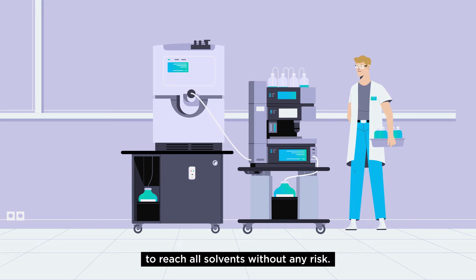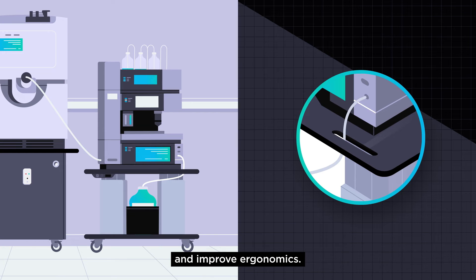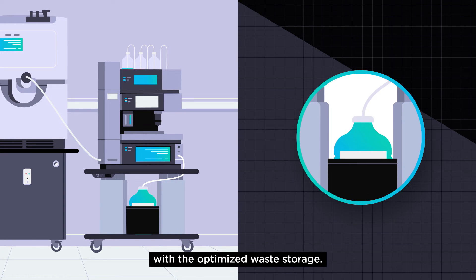It's height adjustable to reach all solvents without any risk and helps keep your workspace organized and improve ergonomics. Your workspace will stay clean with the optimized waste storage.